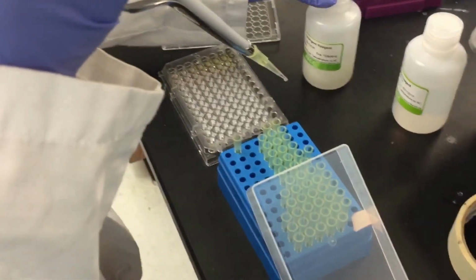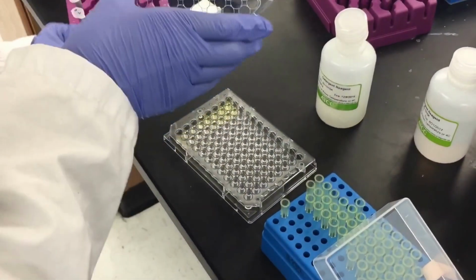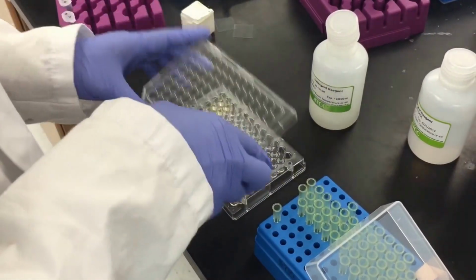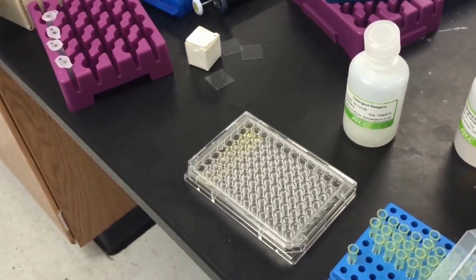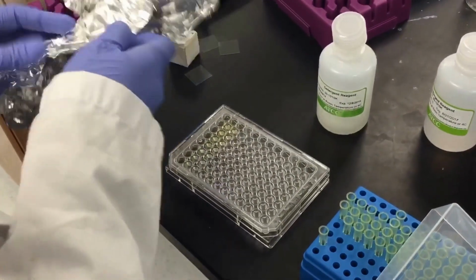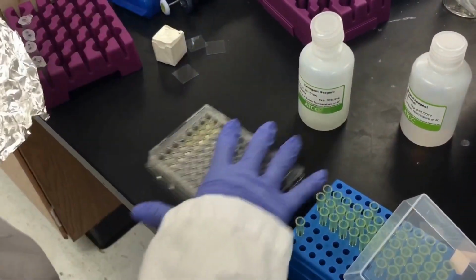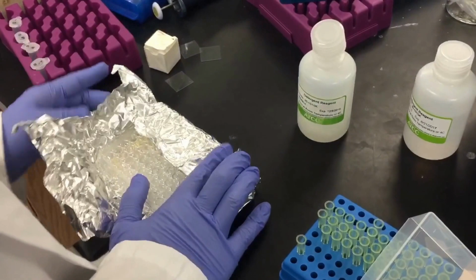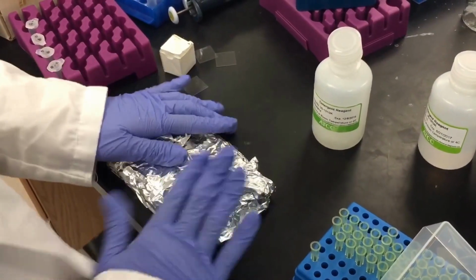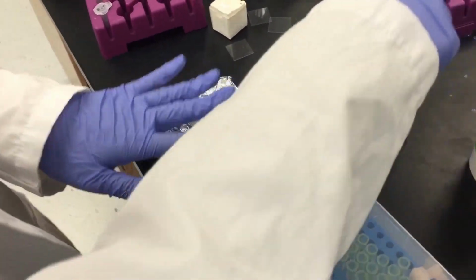Okay, after you're done, you can leave it outside on the table and you wrap it in some aluminum foil. Now you set it aside for around 2 hours, and then after 2 hours you would take it out.